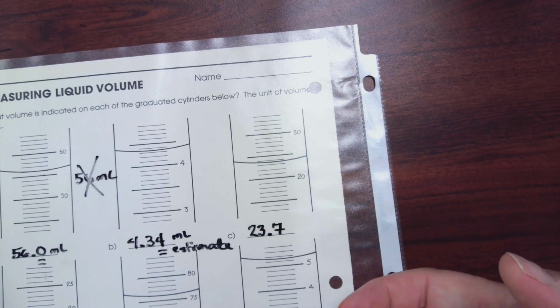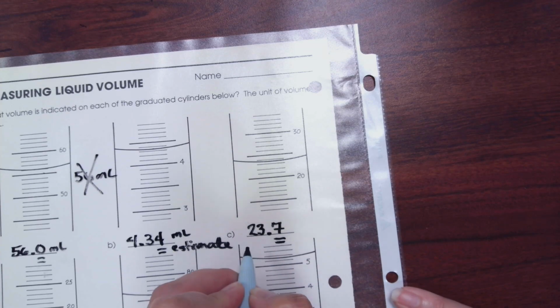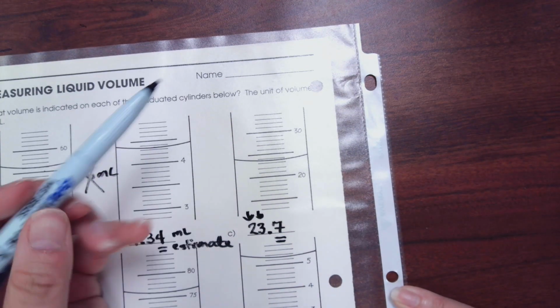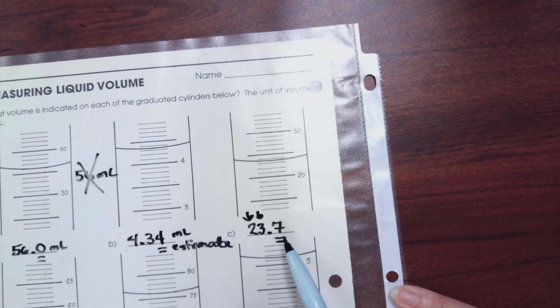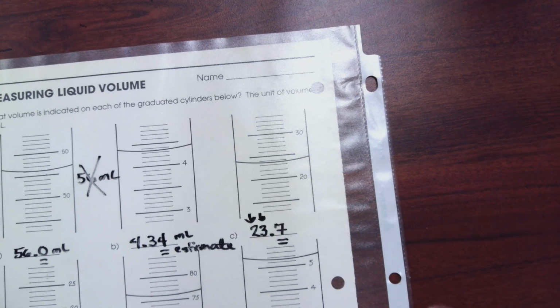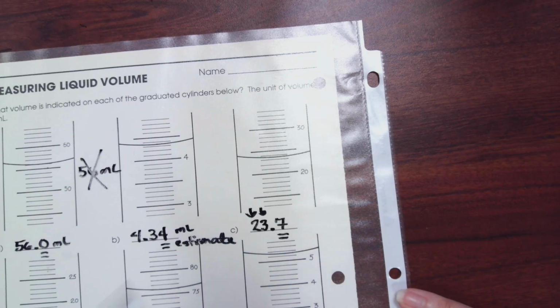Someone else might say 8. Someone else might say 6. That's okay, because remember, this last digit is estimated. These two digits are certain. We know that it's past 20. We know that it's past the 3 mark. So those are certain digits. The last one is estimated. So any measurement you ever take is always going to be your certain digits plus one estimated final digit. All right, let's do a couple examples with a thermometer.